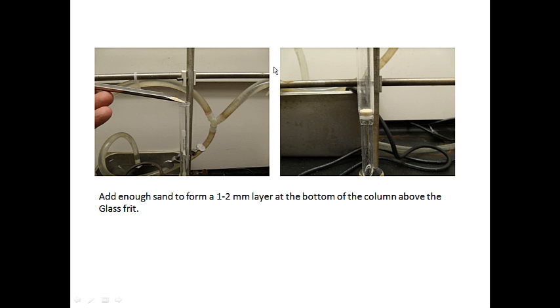So first thing we need to do is to create the sand layer that occurs above the frit. So you're just going to take a little bit of sand in a scoopula and add until you get a 1 to 2 millimeter layer of sand above this glass frit. Okay, and the purpose of the sand is to keep the silica gel, which is much finer, from going into the glass frit and clogging it up.